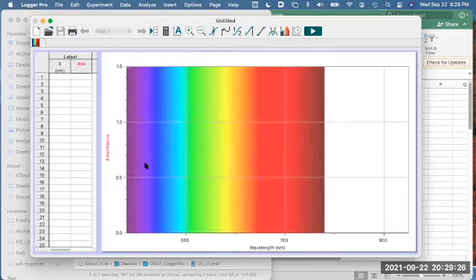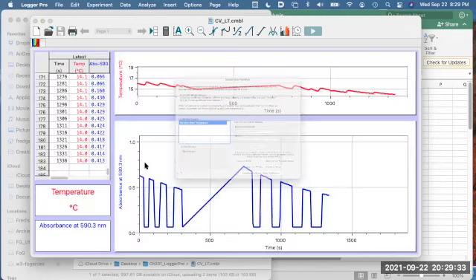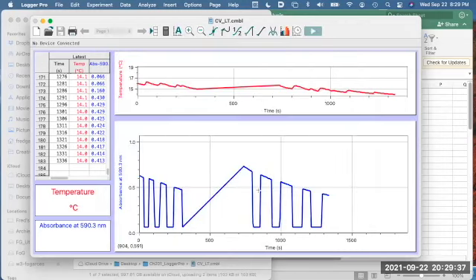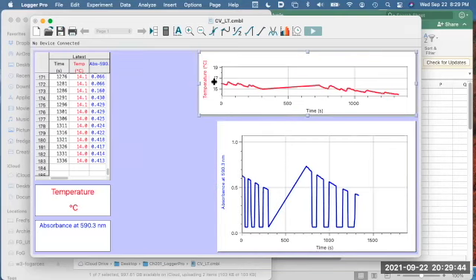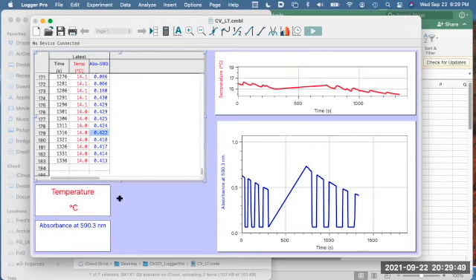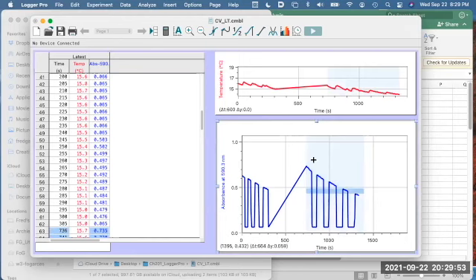and here what you will see is the Logger Pro data set, in which I've done 2 trials for low temperature. So I will probably use this as an example in which I'm going to extract the data and do the analysis to determine what order the kinetics is with respect to crystal violet.